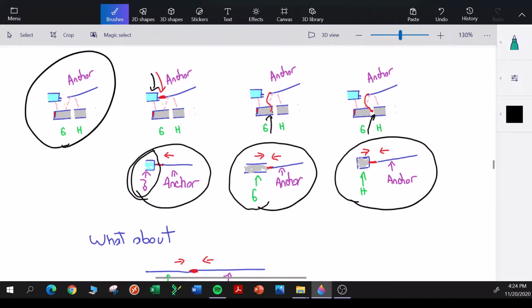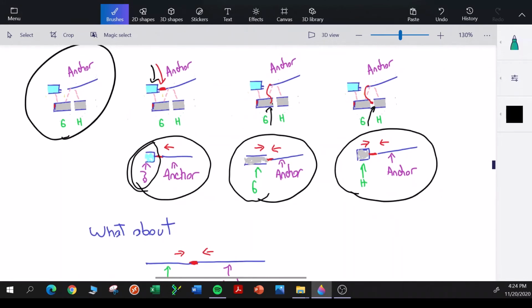The one that should be most frequent is the one that represents the most common 3D conformation of the KLK2 enhancer and KLK2 gene in the cell. I hope that made sense. If not, you'll probably understand in a second.